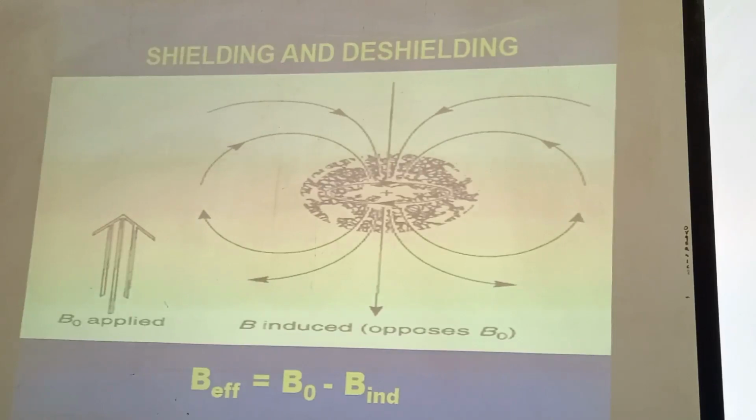That is the information that you get from the resonance frequency, or NMR in a larger sense. You can actually tell that my molecule may have a hydrogen that is attached to carbon, oxygen, or nitrogen. Right? So this is how these nuclei can be differentiated.